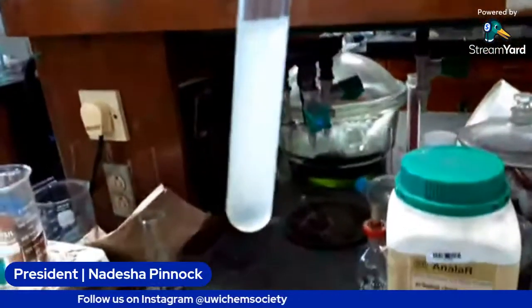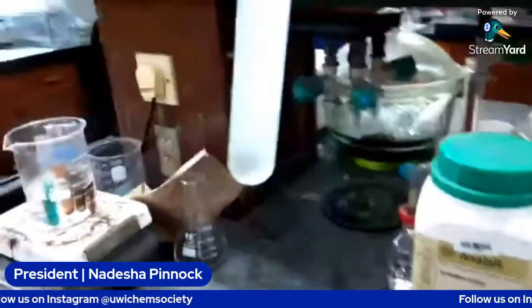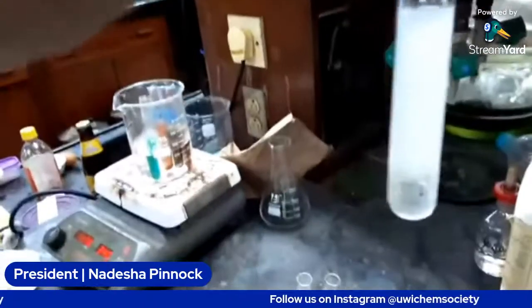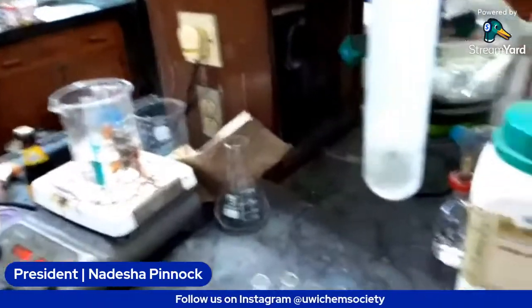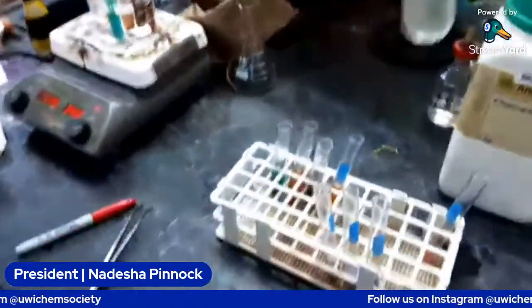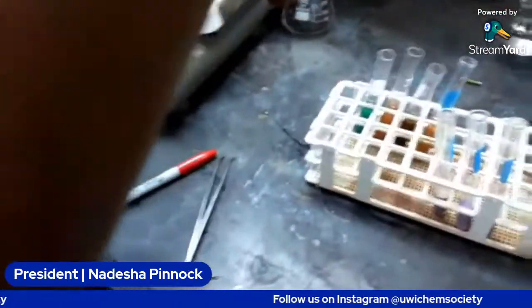So this is how it looks. And as soon as I stop mixing, it starts to separate back. But that's expected, of course, because ethanol is also polar.